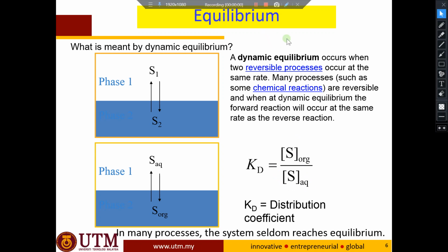Okay, so what is meant by equilibrium in the liquid extraction? You can imagine like this. You have your sample over here inside the aqueous phase. So imagine this is the aqueous phase. Can I make it bigger?